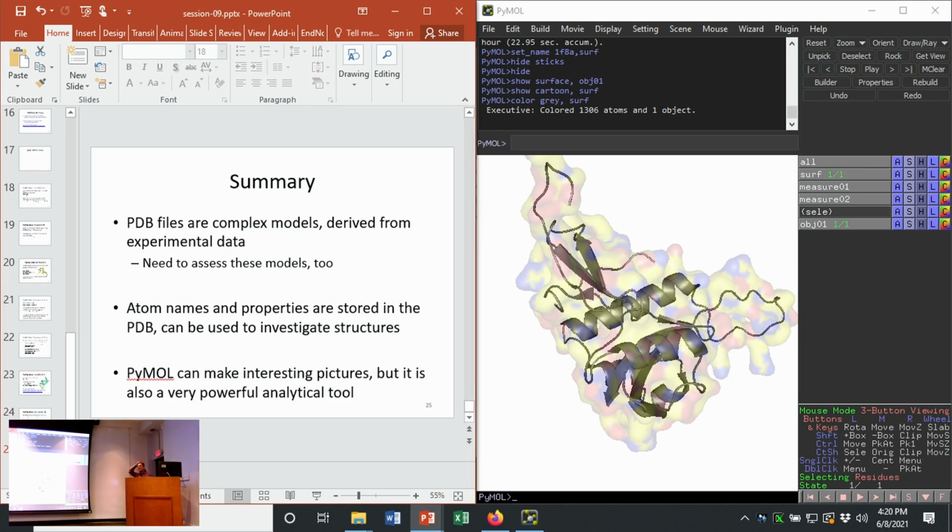And so that's pretty much what I have for PyMOL. It's not a hard program to use. I think there's a lot of cool things that you can do with it once you're familiar with it. Like most other things, you have to spend some time playing with it. There's that word play again. But if you use this to generate models, PyMOL can be useful in both showing and doing some analysis of protein structures. For example, is a residue exposed? Is a residue buried? It can also be useful in making pretty pictures and conveying those ideas to others.